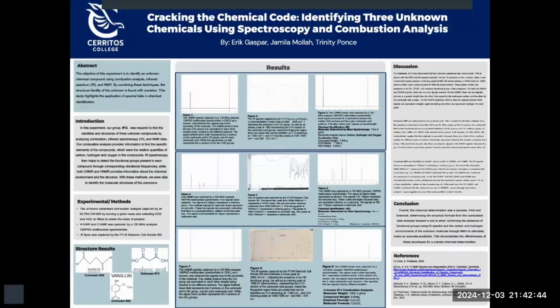Hello, everyone. This is an experimental demonstration about cracking the chemical code and identifying three unknown chemicals using spectroscopy and combustion analysis. We're students from Cerritos College.